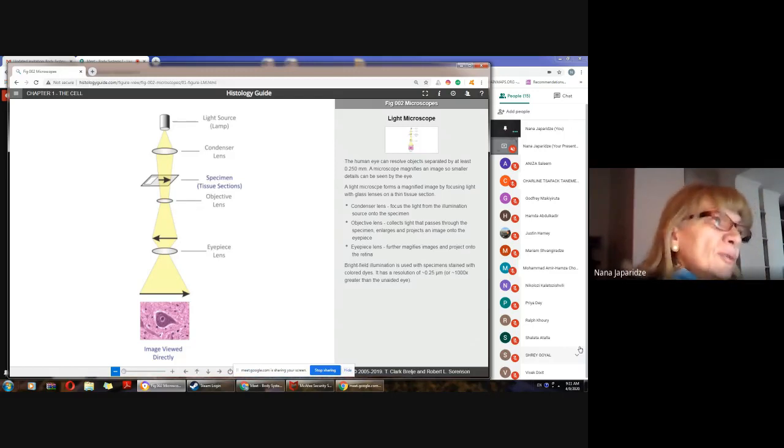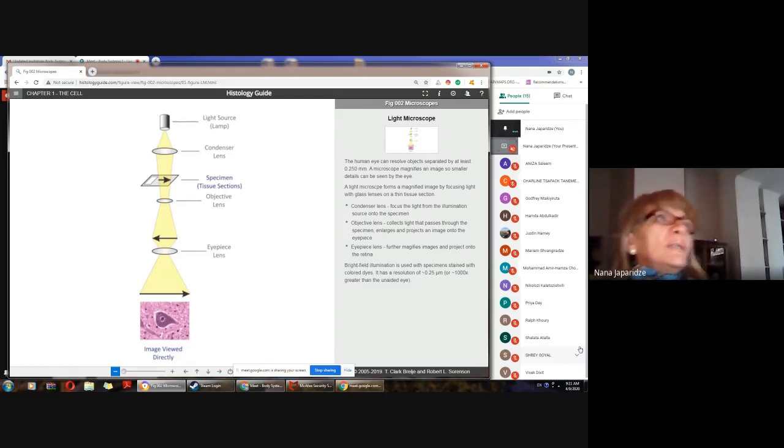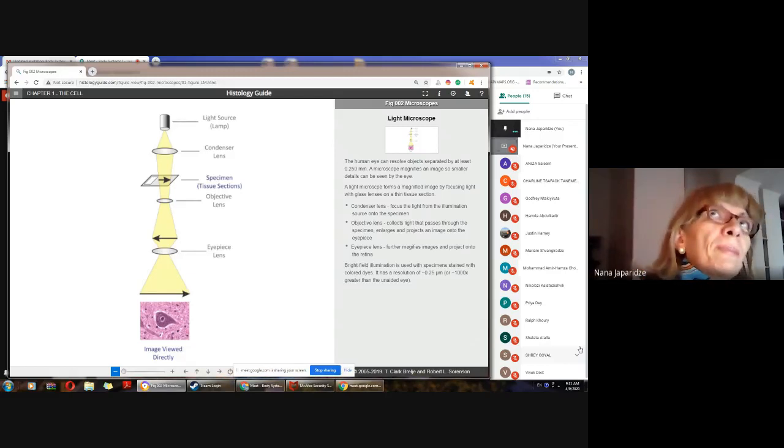For example, in the case of light microscopy, usually paraffin or other types of artificial resins are used. In melted paraffin, at quite a high temperature, for example 57 or even 60 Celsius, the infiltration process takes place very actively.